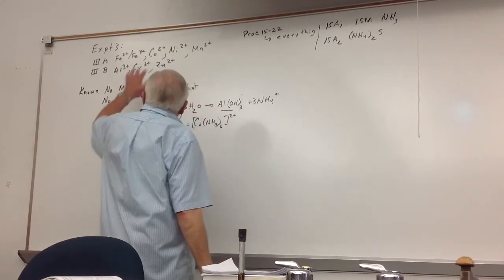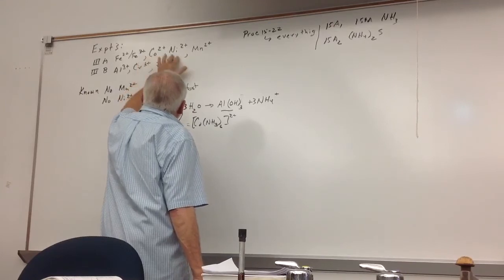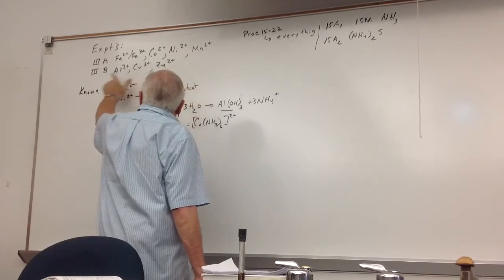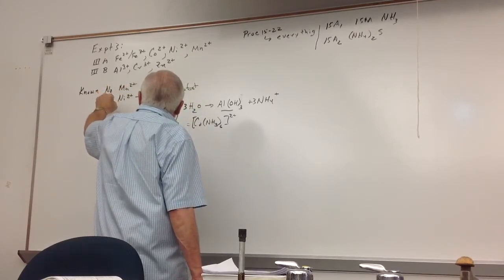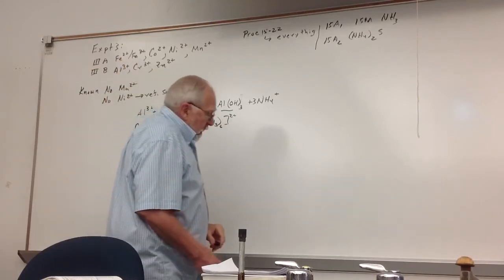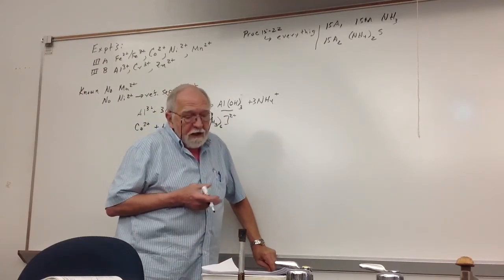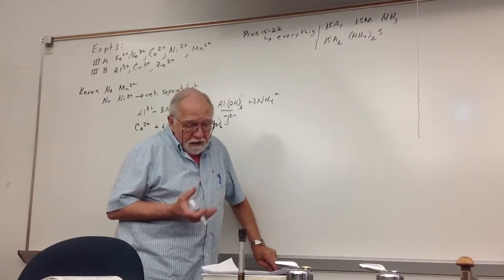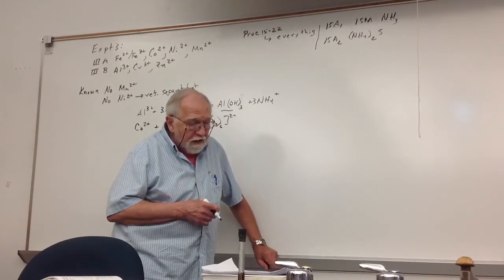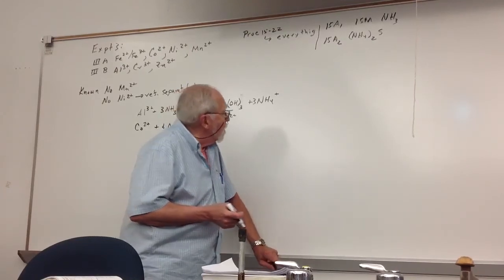First of all, the cobalt 2 sulfide is going to be black. Okay, this is black. This would be a tan colored form. These don't really form sulfides. You don't have to worry about that. But these will form black sulfides also. And even if the hydroxide is there, as you add the ammonium sulfide, some of the hydroxide precipitate for the irons, the 2 iron hydroxides, do get converted to sulfides. So at that point, you'll have both sulfides of iron and cobalt.